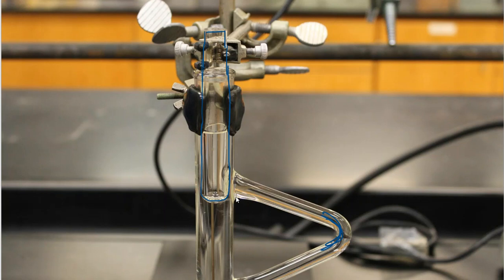If I begin to put my sample down into the Thiele tube, and I've seen people do this before too, for goodness sakes, they almost catch the lab on fire. That's bad news, right? So the test tube only goes into the Thiele tube. And then I'll put my sample in the test tube, not the Thiele tube.